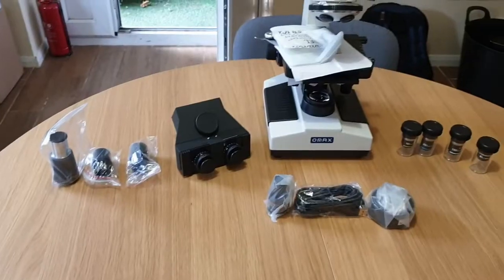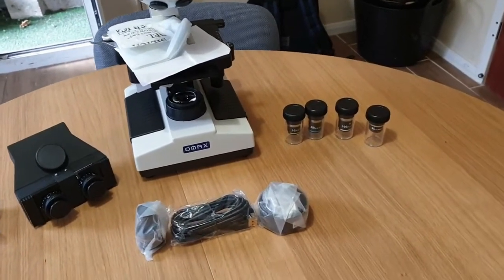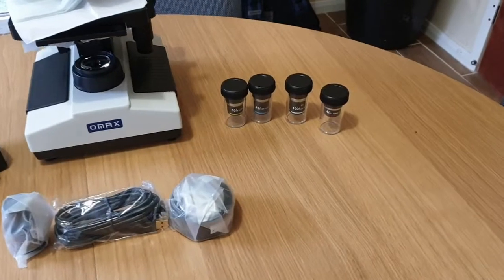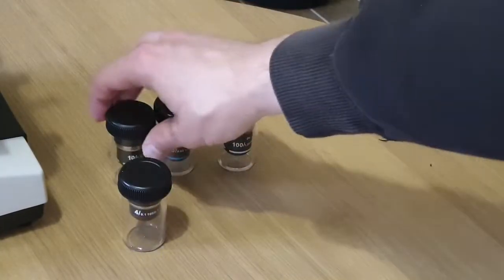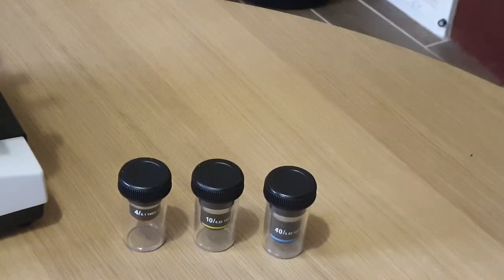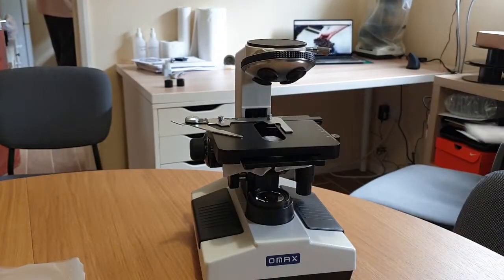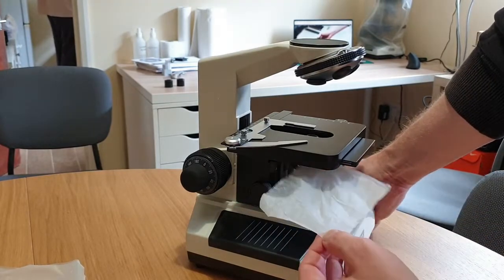There are elements in this kit which we don't use in day-to-day work, so to help you get ready faster the ones that do get used are laid out here. This also includes not mounting the 100x objective, which is not necessary and creates a risk of damaging the samples, so we'll set it aside. You will find a dust cover packed with the main body of the microscope. There is also a silica gel bag and a couple of pieces of paper to remove.